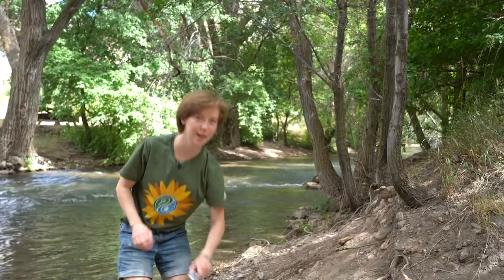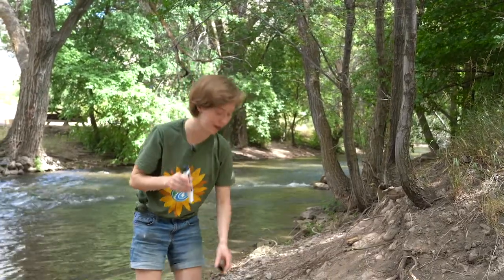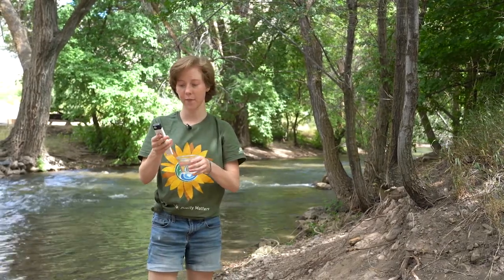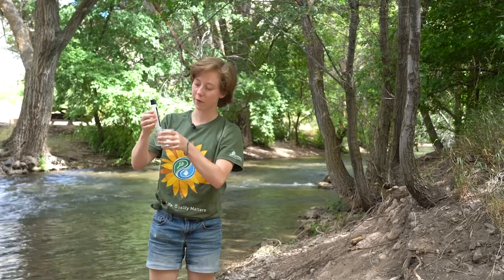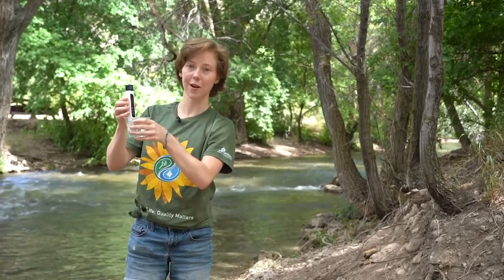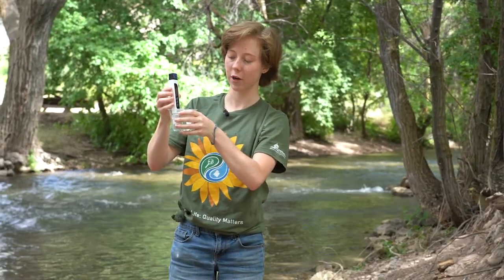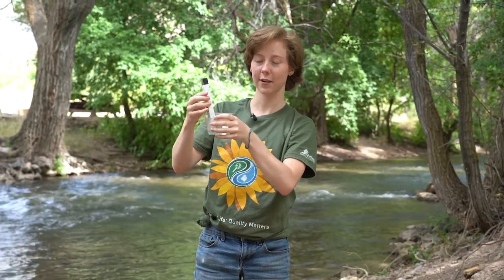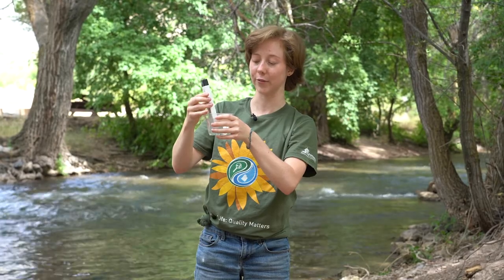Once you've collected your sample, take the cap off the end of the meter. Turn the meter on and place it in the sample in between the minimum and maximum lines on your meter. It can take a minute for the reading to stop moving up and down on your meter. It can take up to 10 or 30 seconds.